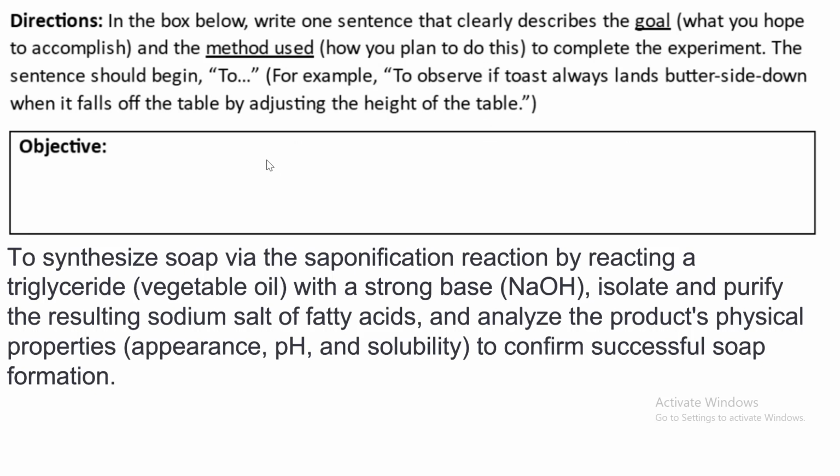So our objective for today's experiment is to synthesize soap via the saponification reaction by reacting a triglyceride vegetable oil with a strong base, NaOH, isolate and purify the resulting sodium salt of fatty acids, and analyze the product's physical properties, appearance, pH, and solubility to confirm successful soap formation.